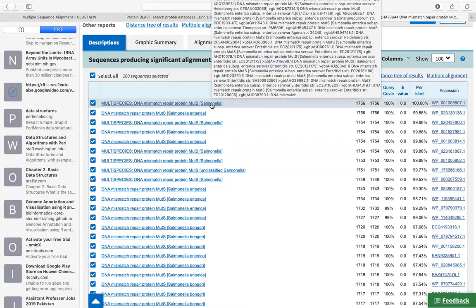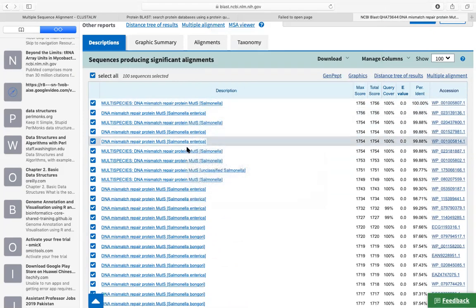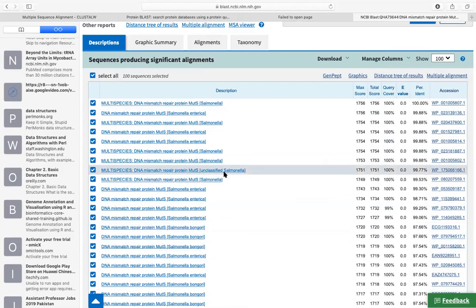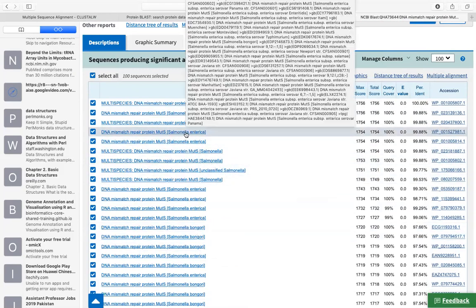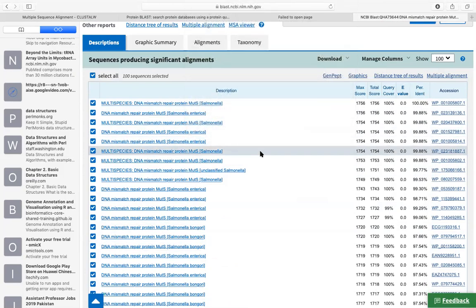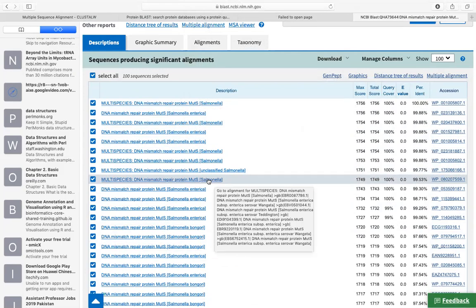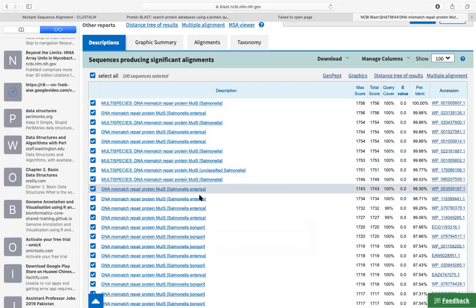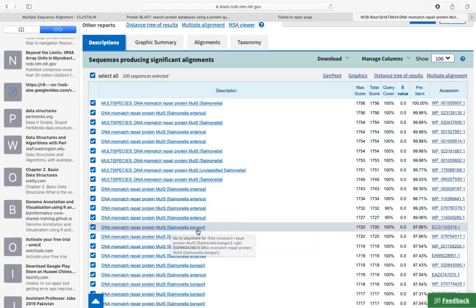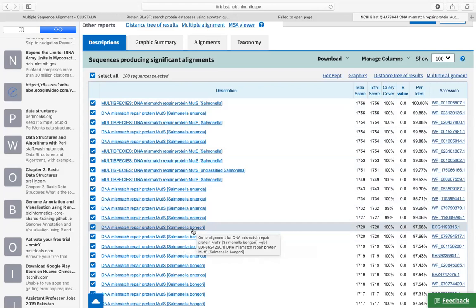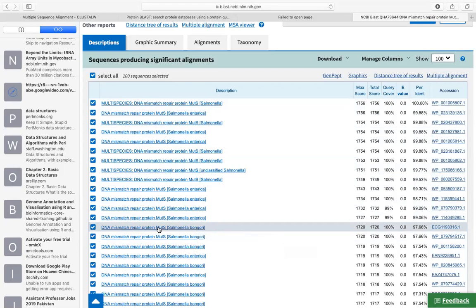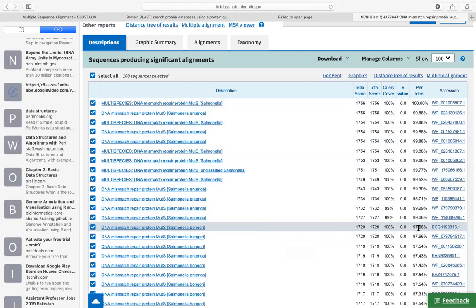Salmonella enterica is our species and MUTS is the gene. Now we don't have only Salmonella — we have excluded Salmonella enterica. If someone comes up, there will be entries from other species. There will be Salmonella entries since I wrote only two exclusion entries. Going ahead — this is Salmonella MUTS — we are interested in these. Query coverage is 100%, identity is good, and E-value is good. These are the three parameters to interpret BLAST results.